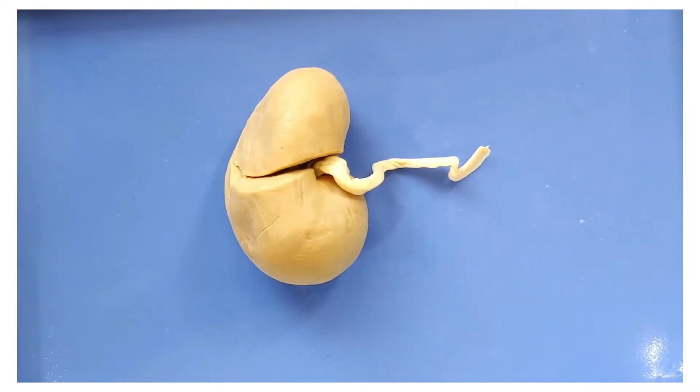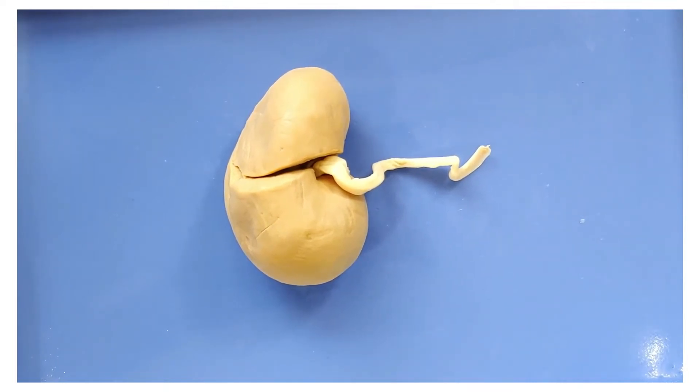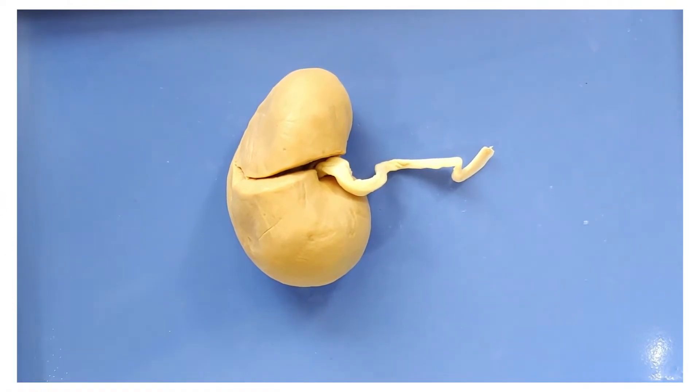So this is a sheep kidney, but it's very similar to a human kidney. Kidneys come in pairs, one on each side of your body. Each kidney has about 1.5 million blood filtering units called nephrons, but people only need a minimum of 300,000 nephrons to filter blood properly.